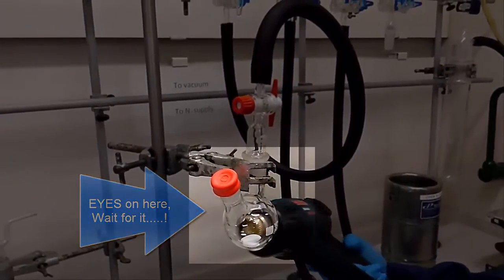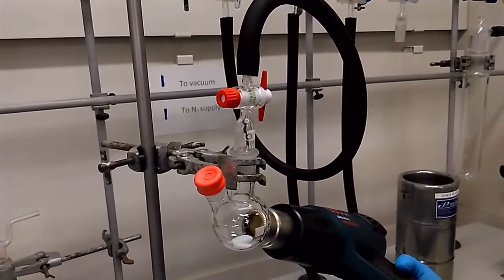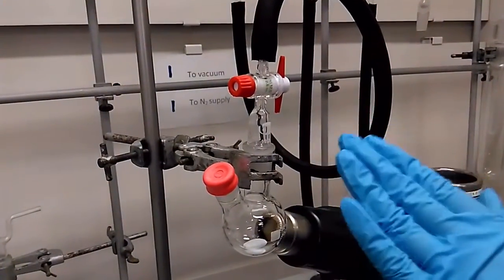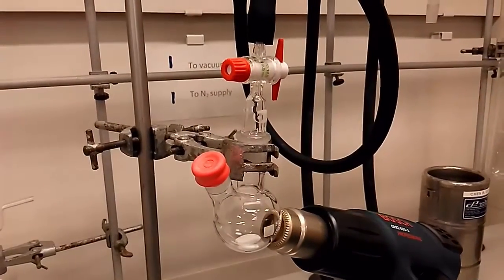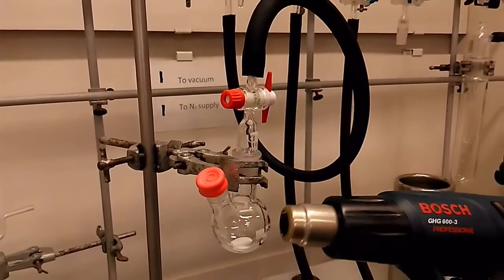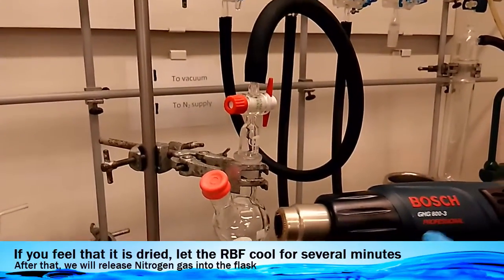See that? Wow. It's bright. Typically if we have some moisture, you can see some moisture being condensed near the glass joint. So now we have the dry RBF and it's under vacuum. We need to let it cool for a few minutes, and then we will refill with nitrogen gas.